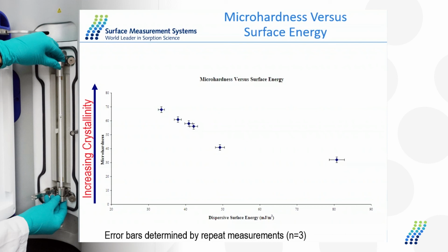So the fundamental measurement is not affected by surface shape or size, but in reality, very often the surface energy can pick up changes in aspect ratio or particle size, but that's because the actual surface is changing, not that the technique doesn't work.